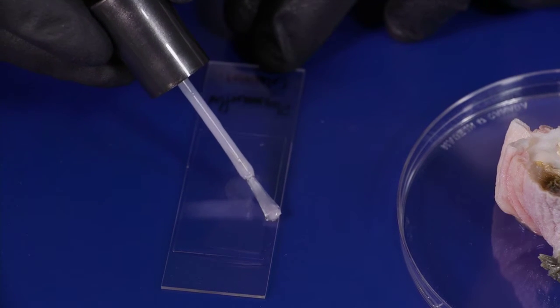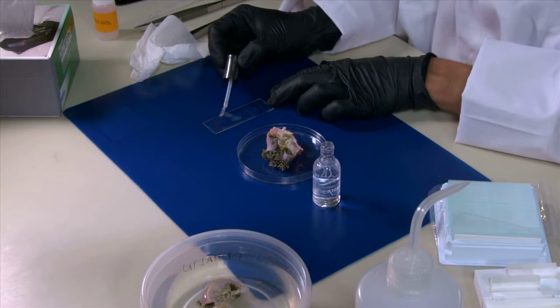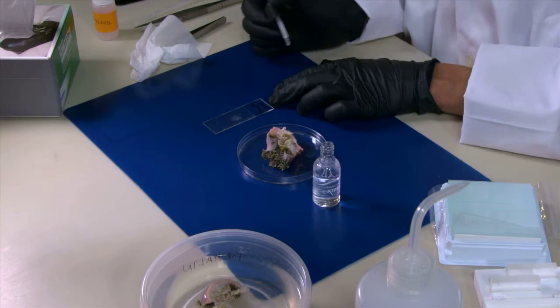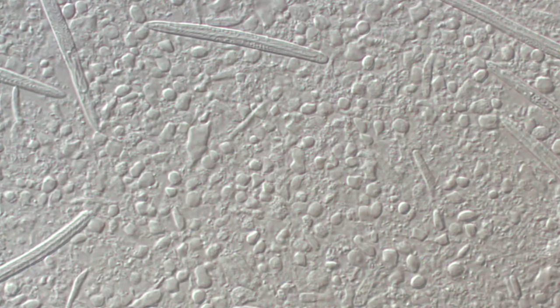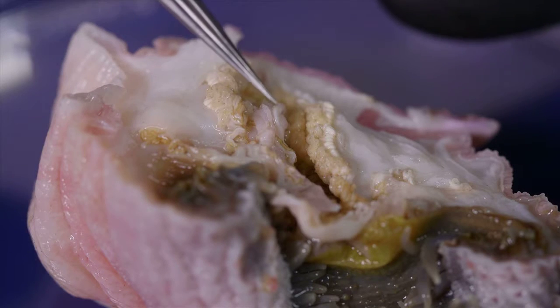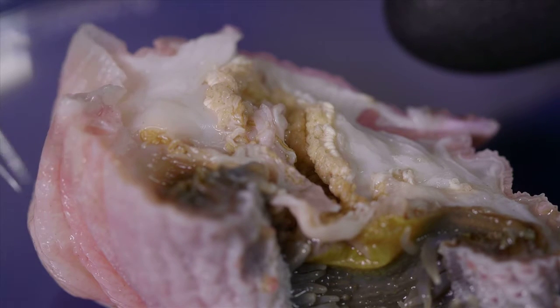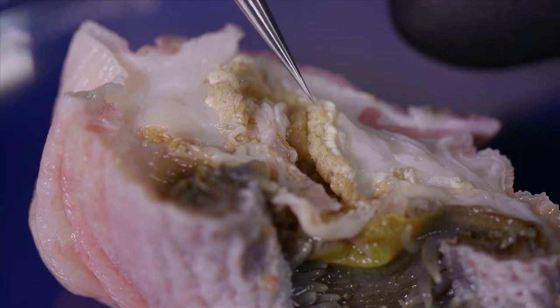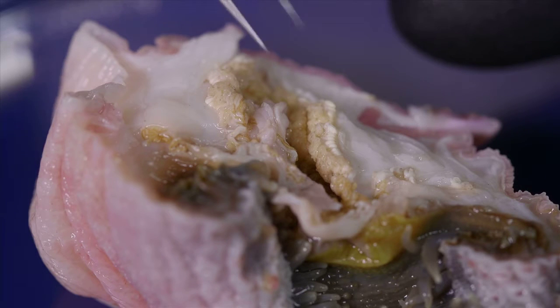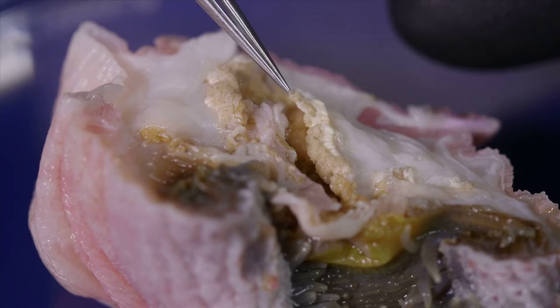At this point the slide is prepared. We just need to let it dry for about ten minutes before we can observe it under the microscope. For most parts of the body, scratching could be enough to get the tissue. However, for the mesenterial filaments or the acontia, taking a little piece could be easier.